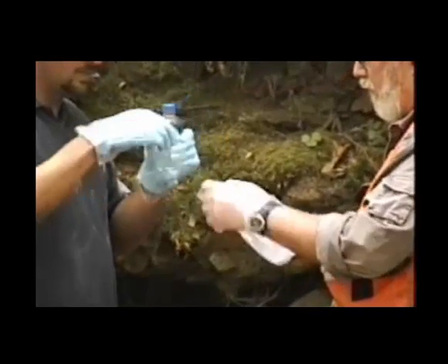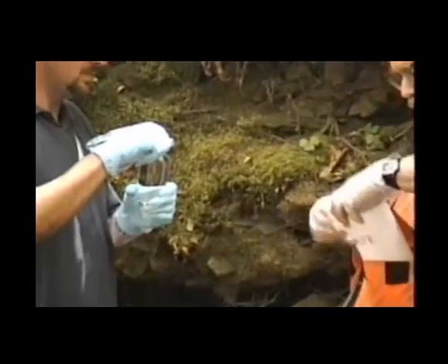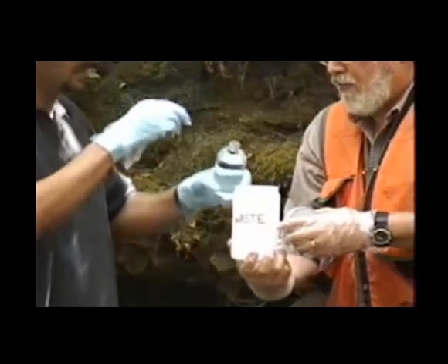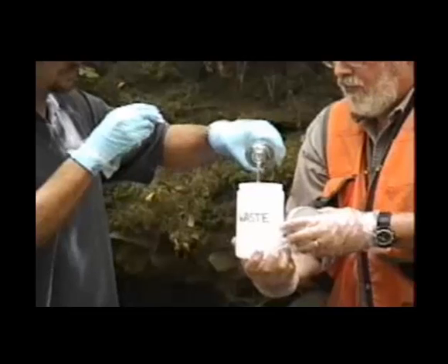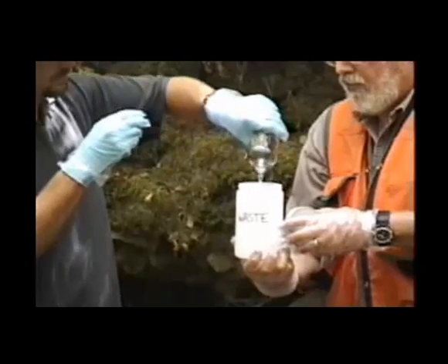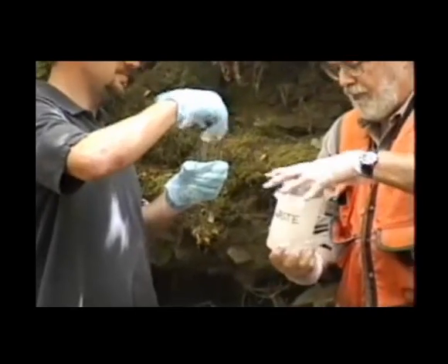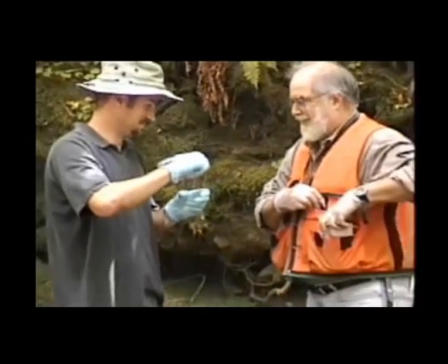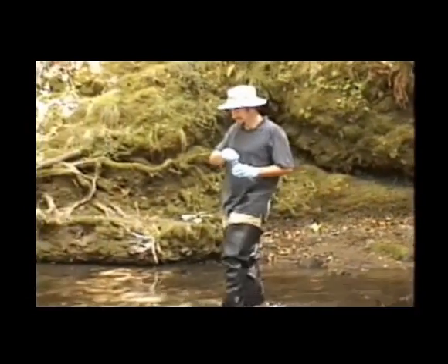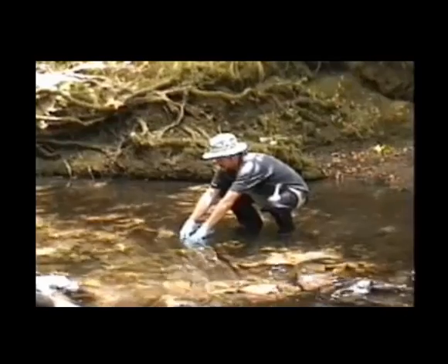Dirty hands seals the outer sample bag and then presents the waste container to clean hands, who then removes the cap, pours the preservative into the waste container, and then recloses the sample container. Dirty hands then replaces the cap on the waste container and stows it away. Clean hands now goes to the sampling point, taking care not to open the sample bottle until the sample bottle is under the surface of the water.